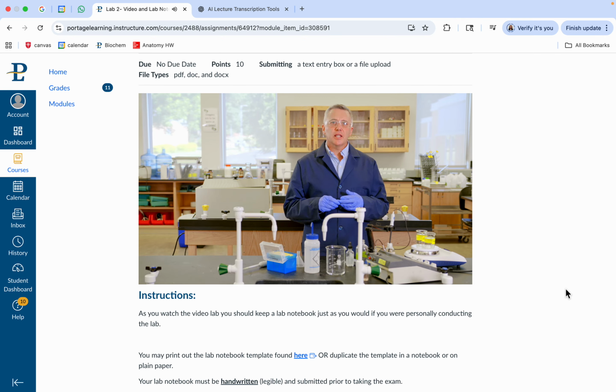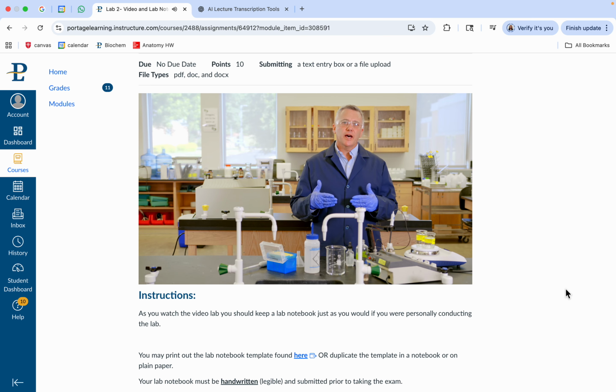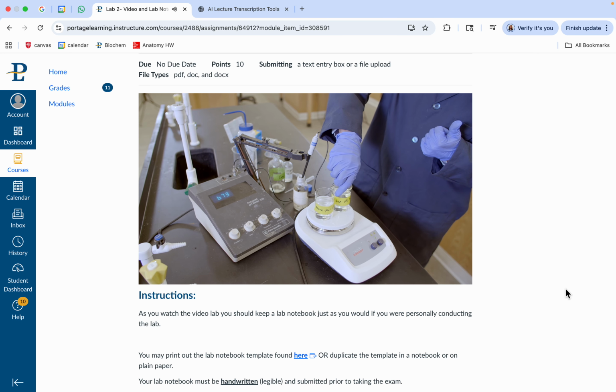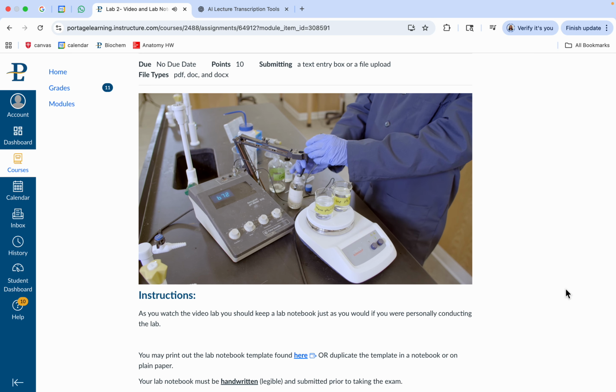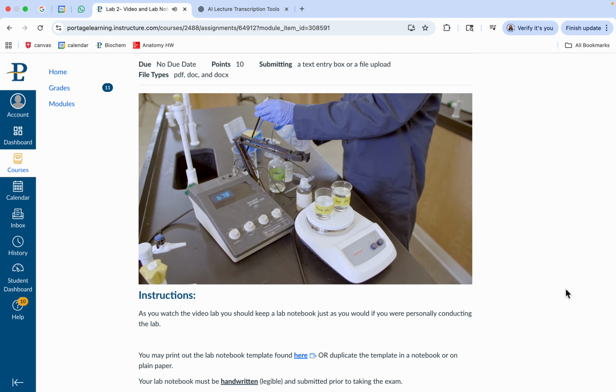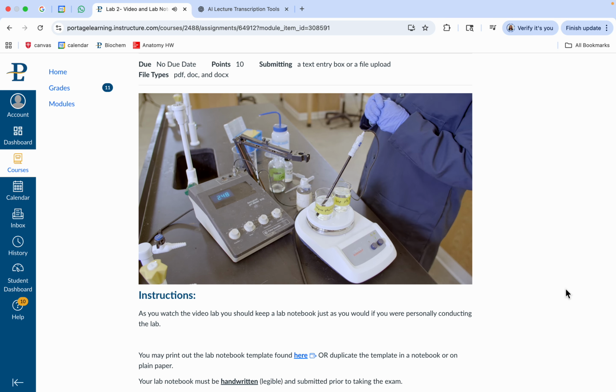So let's take a look at one amino acid, glycine. Glycine actually has two pKa values, one down at about 2.35, as we put in our beaker, and also one at 9.6. One deals more with the carboxylic acid, and the other deals more with the amine group. So we made a solution of glycine, and then adjusted the pH to be down around those pKa values. Again, this will help demonstrate its ability to act as a buffer.